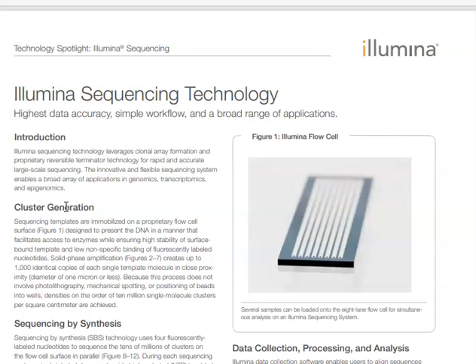Now those oligos come in two different types, and they recognize two different types of oligo on the flow cell. And basically the oligos on the flow cell bind to the oligo linkers that we've added to the end of our fragmented DNA, and that captures the DNA, and then we perform something called cluster generation. I wouldn't say it's like PCR, but it's a DNA amplification technique that allows up to 1,000 identical copies of a piece of DNA to be created by solid phase amplification. We call that bridge amplification, and I'll show you how that works in this document and in the session. And it's also present on the Illumina video, which you're going to watch next.